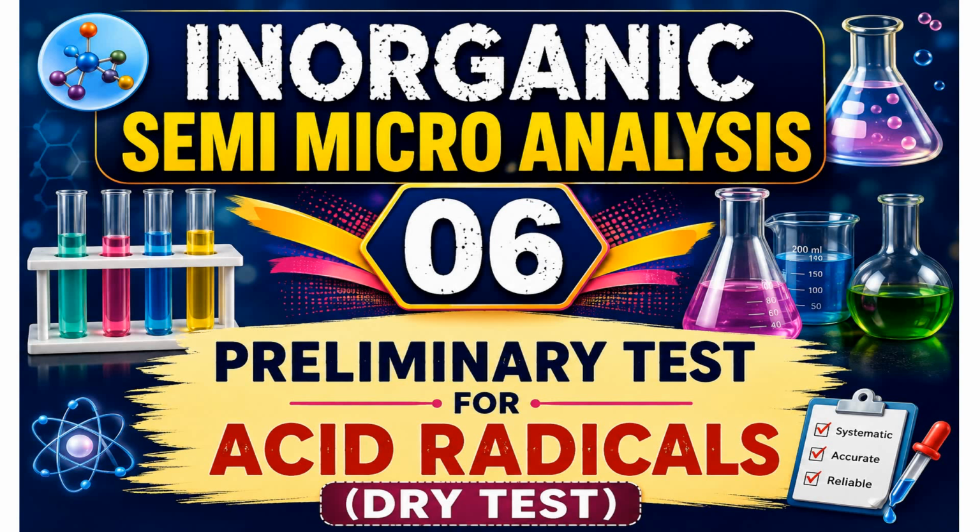Hello my dear students, welcome to another video on inorganic semi-micro analysis, and this is video number 6, where I'm going to discuss preliminary tests for acid radicals, that is the dry test for acid radicals. Here, I will discuss the experiment and the reaction involved as well as the concept involved in the reaction. So, let's start.